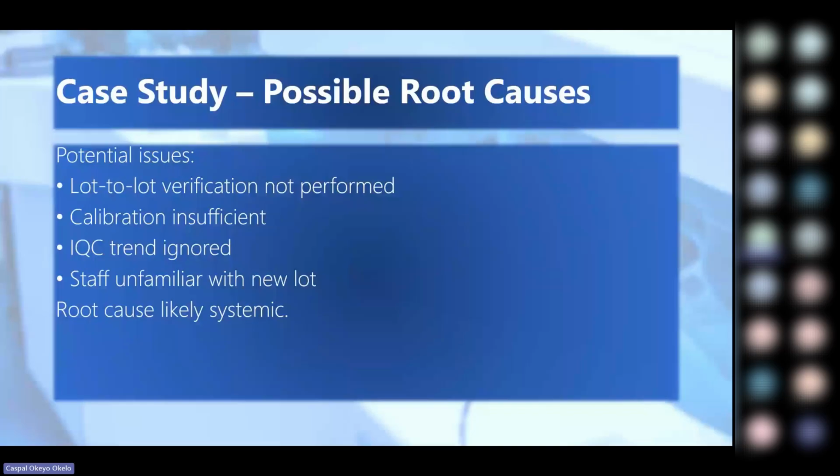And that leads you to your 5th why. Why does the laboratory lack an enforced lot verification system? A systemic issue. Because there's no structured quality oversight mechanism that is supposed to ensure that SOP compliance is monitored. There's no mandatory documentation review. There's no defined accountability for reagent changes. So at this point, you shall have reached your root cause, and you shall have identified that your root cause was inadequate system control over reagent lot verification and SOP enforcement.